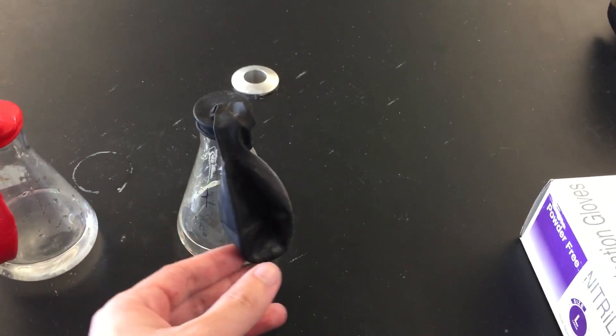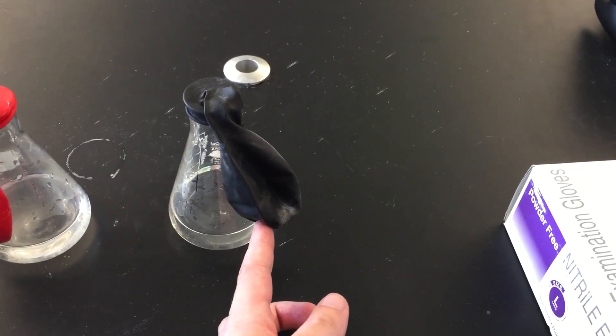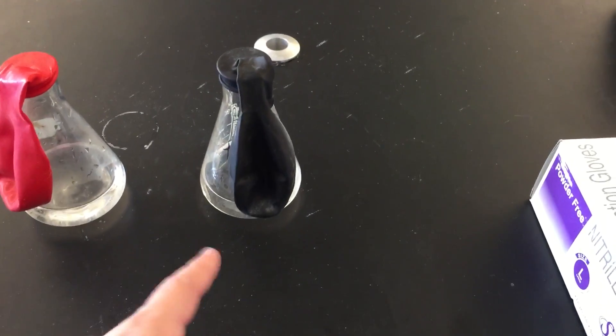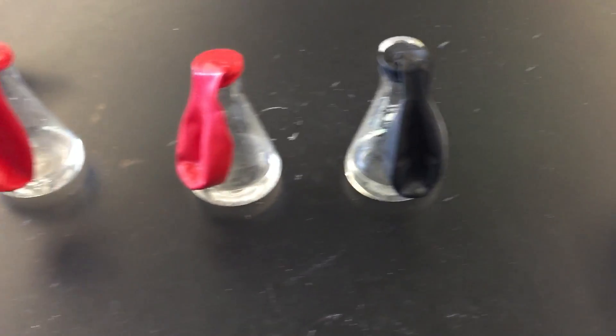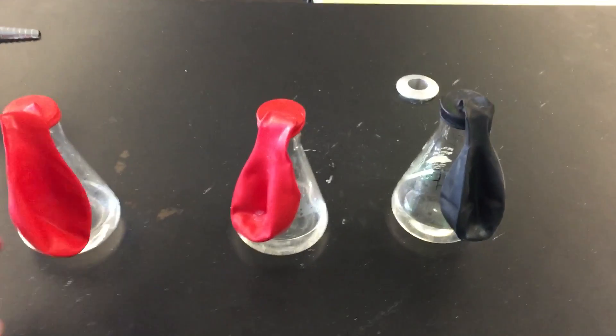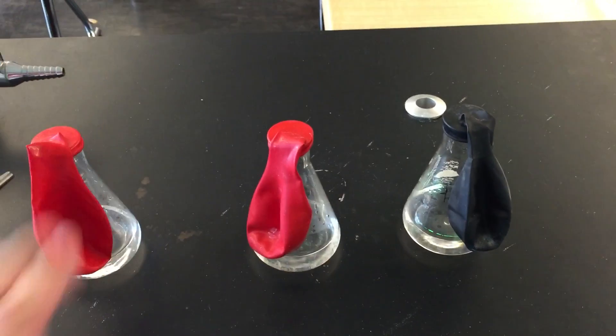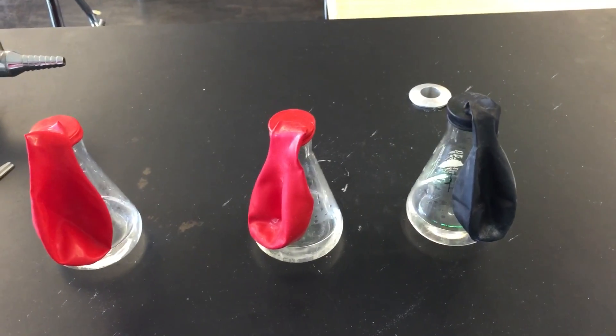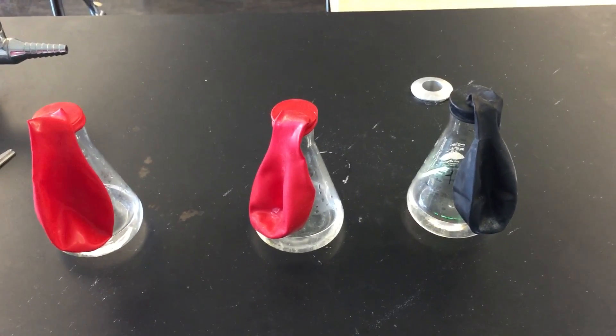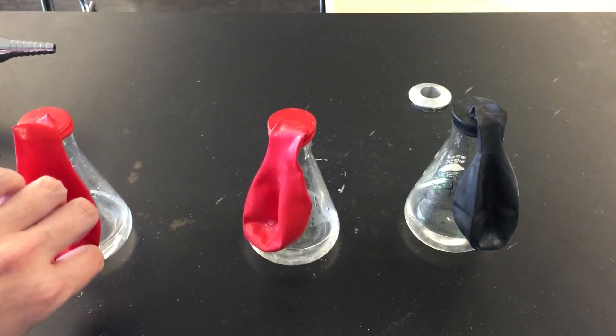And the black balloon has the most. It has 5.5 grams in the balloon and then you can see that there are still the exact same amount of vinegar in each one. So what I'm going to do is I'm going to invert these balloons and we're going to see what happens. I might have to hold them down so we'll see if I'm able to record all of this at once. But here we go.